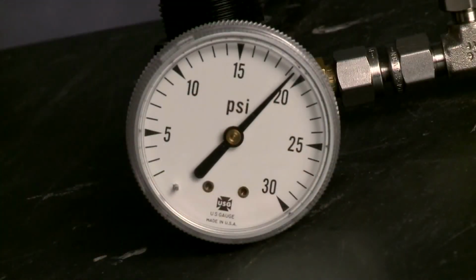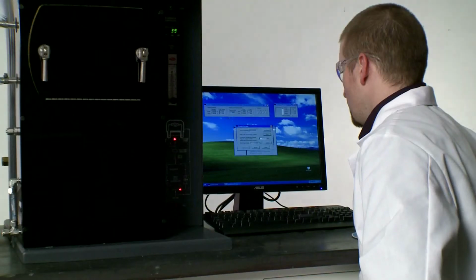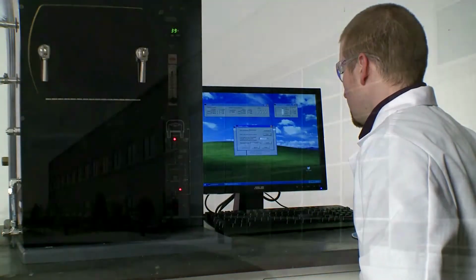Once you have watched this video and can confirm that your lab is indeed ready, please contact your service representative directly to confirm the installation date.